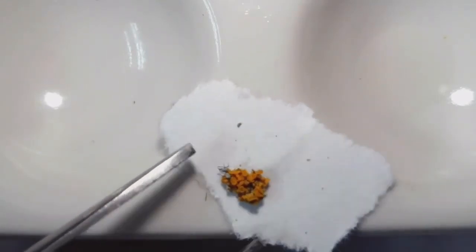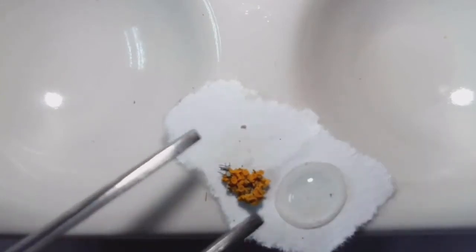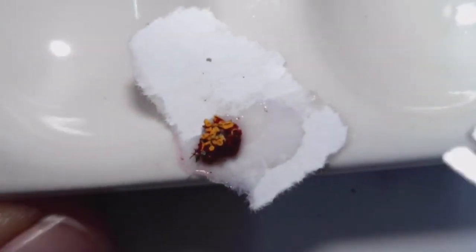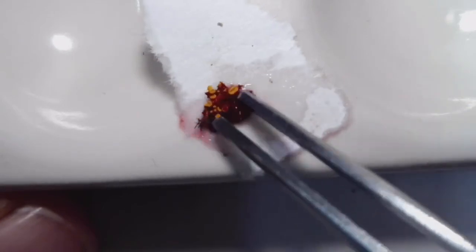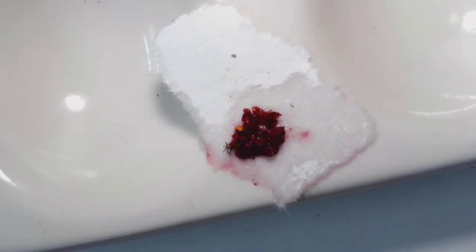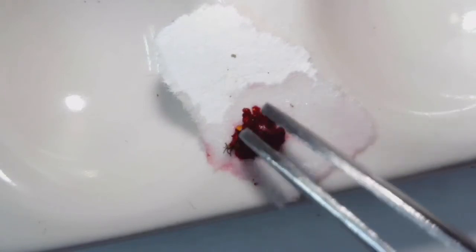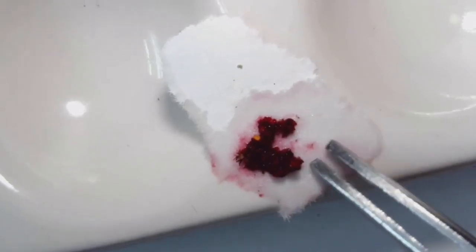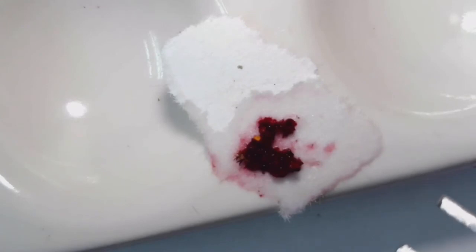So now again, I add my K right there, and I'm going to, ooh, look at that. Wow. That was fast. See, I can just mush it in now. Look at that color change. This is one of my favorites. I really love these really obvious colorful ones. So that is a definite K plus P for purple reaction. So this is definitely either the genus Xanthoria or Xanthomendoza.